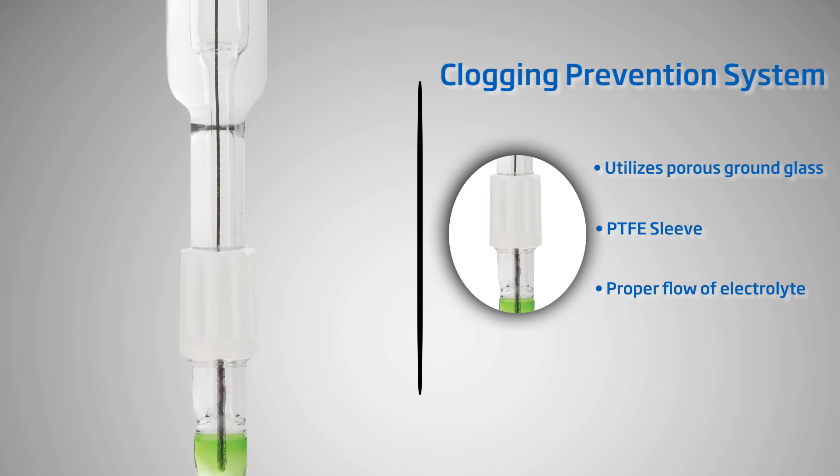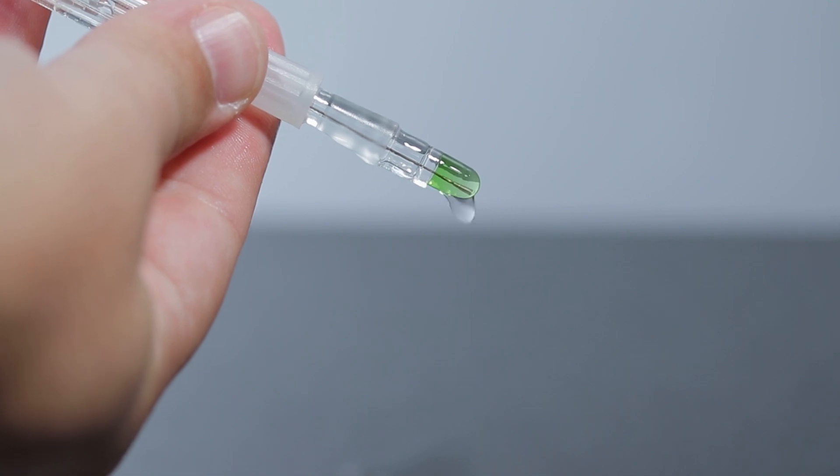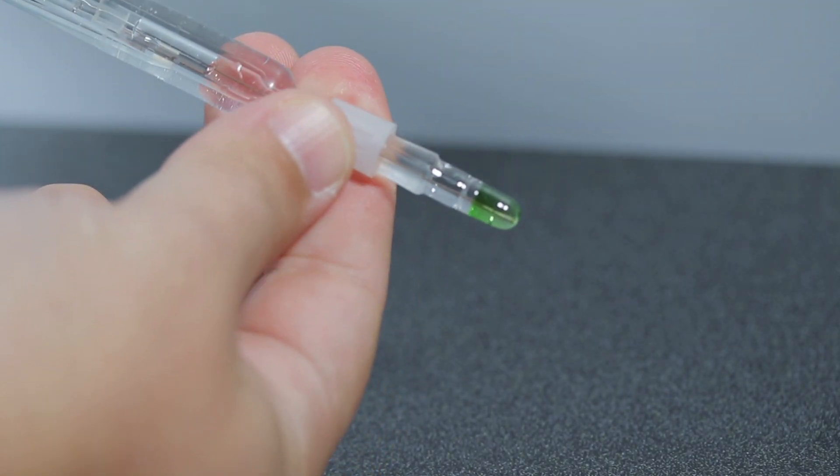The electrode is designed with a tapered glass body so that the sleeve fits securely near the tip. If the junction is loose, you will notice the electrolyte flow out of the electrode quicker than normal. The sleeve junction should never be loose while measuring.